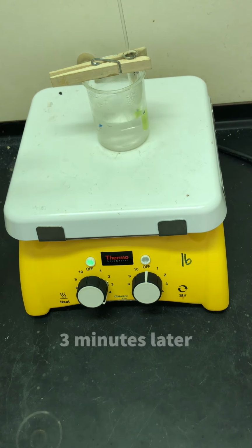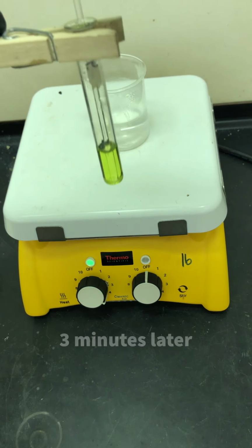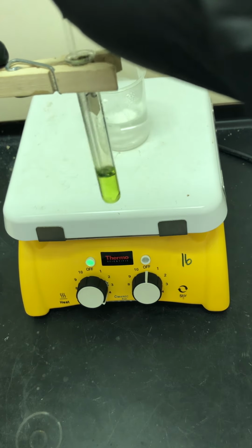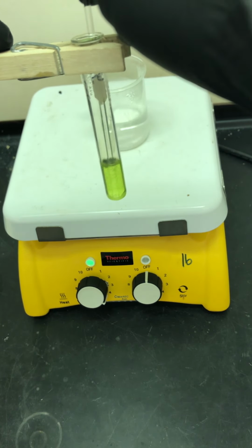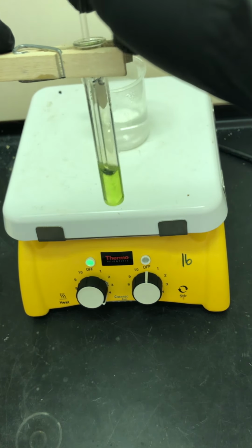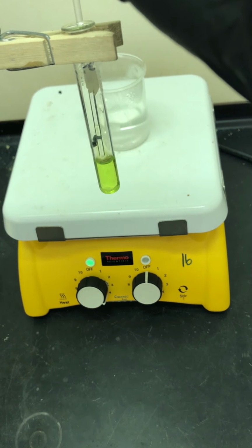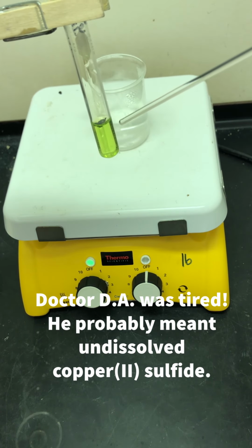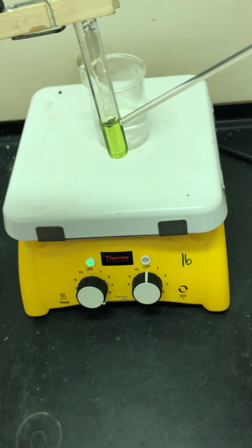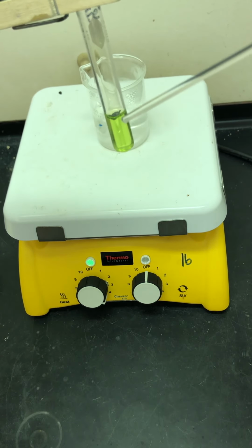Okay, after 3 minutes, we want to take a look at what we have in here, and what we observe is that there's still a bit of residual precipitate. Ideally, all of it should have dissolved, but what's important here is the color of the solution. Notice the bluish greenish color. That indicates the presence of copper 2 ions. That residue there could be sulfide or something. So I'm going to respin this so I can get rid of that little piece of junk in there, and I'm going to pour or decant the supernatant into a clean test tube.